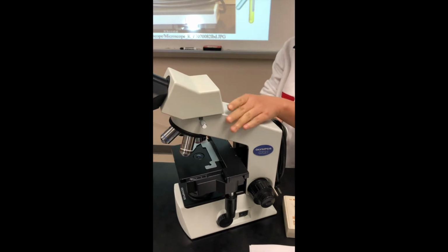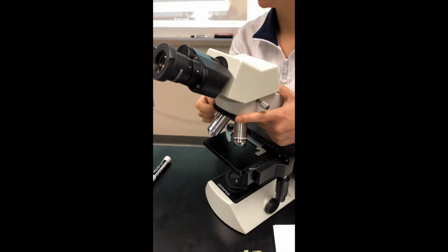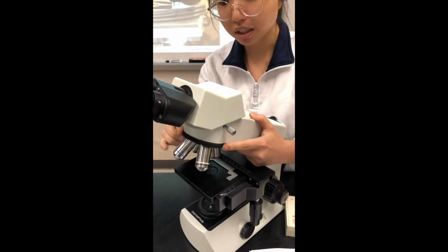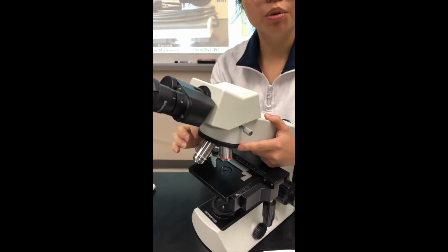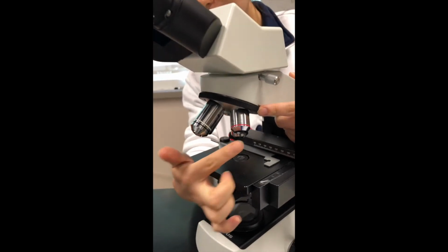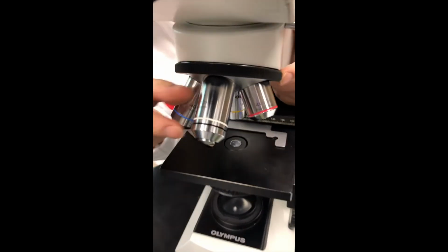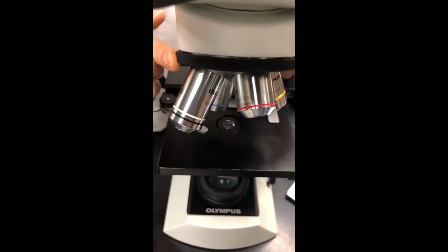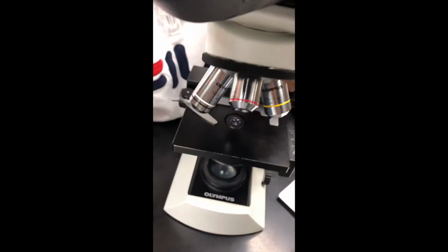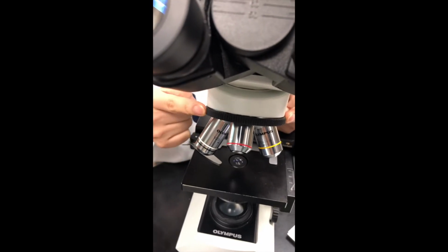This is our optical head, and going down here is our turret, or you could say the nose piece. And this part is important because every time you want to change your objective lenses, here are our 4 different objective lenses with different colors. See, here is the white color. The longest one shows you the white color, and the shortest one, our 4 times objective lens, shows you in red color. So we have 4 different objective lenses attached to our nose piece.